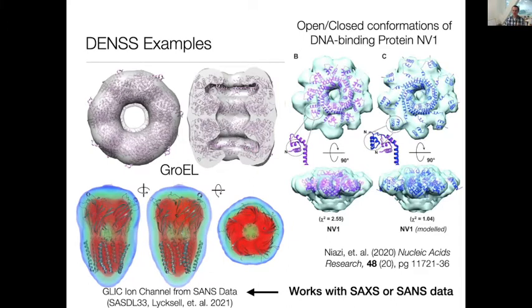And not only can you see the nice symmetry, you can actually see these little holes in there at relatively high resolution, which was pretty neat. So it works pretty well.